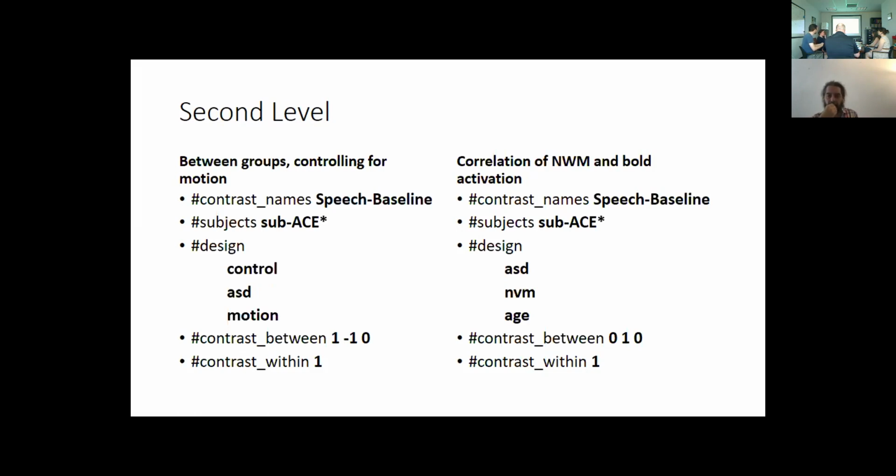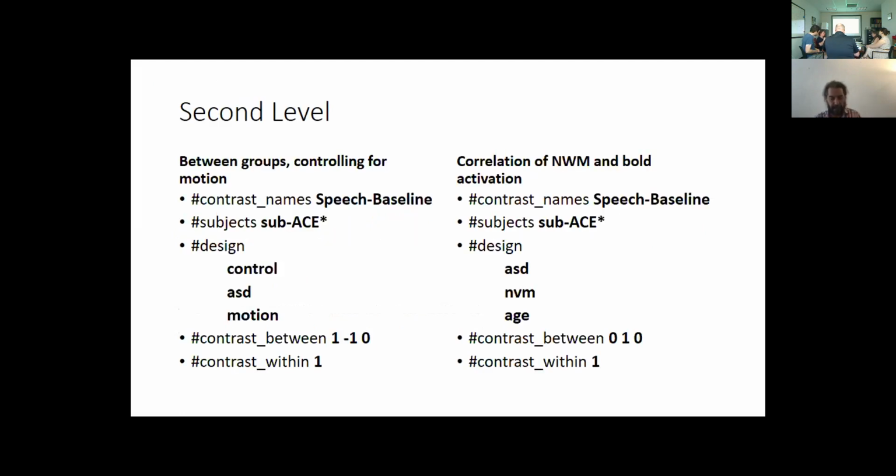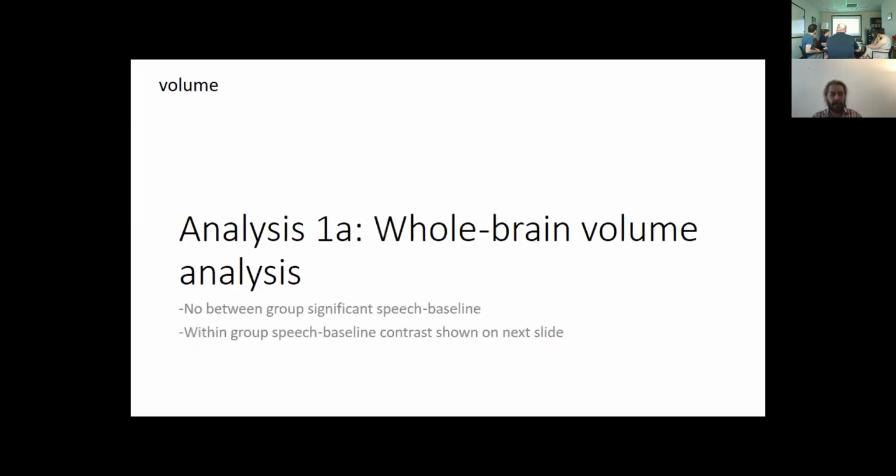Okay, so I have just a couple of result slides, just to make sure I am interpreting them correctly. So this is the volume. Before we get to the results, since this is a summary of the configuration files as well, and it's very nice because it's an overview of all of them, do you mind if I add a couple of comments about the configuration files in the different steps, just for clarity? I also have ROI files later if you want me to do that. Oh, that's fine. Okay, then finish, and then we'll come back.